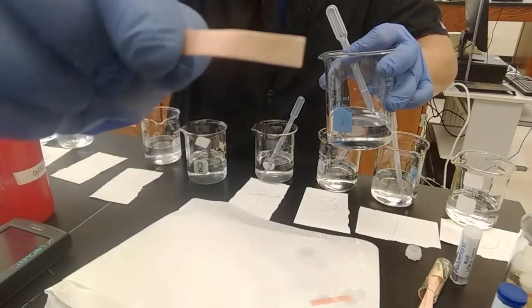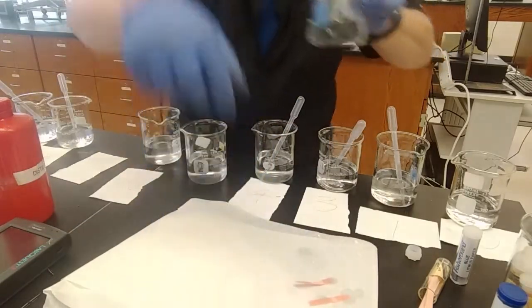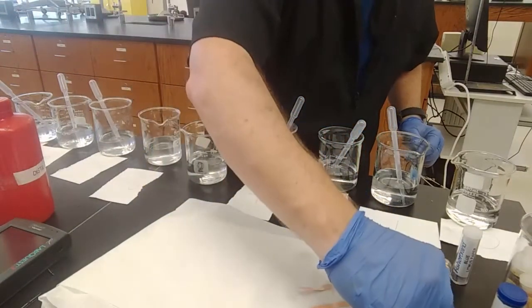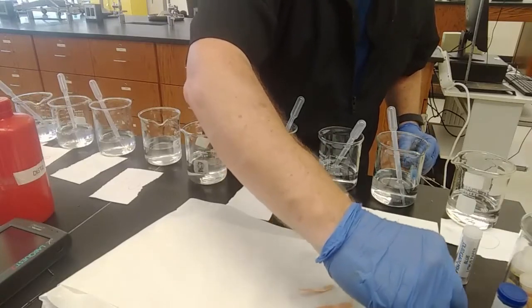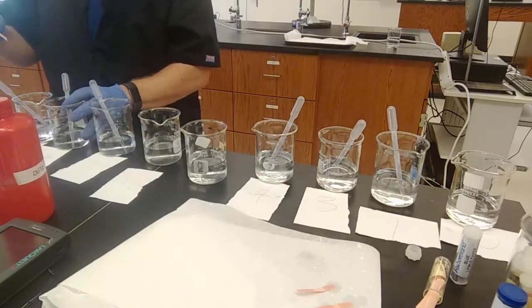No change. No change. All right, 13 now on the meter was basic, unlike 10 and 11, which were acidic, even though we didn't think that they should be.